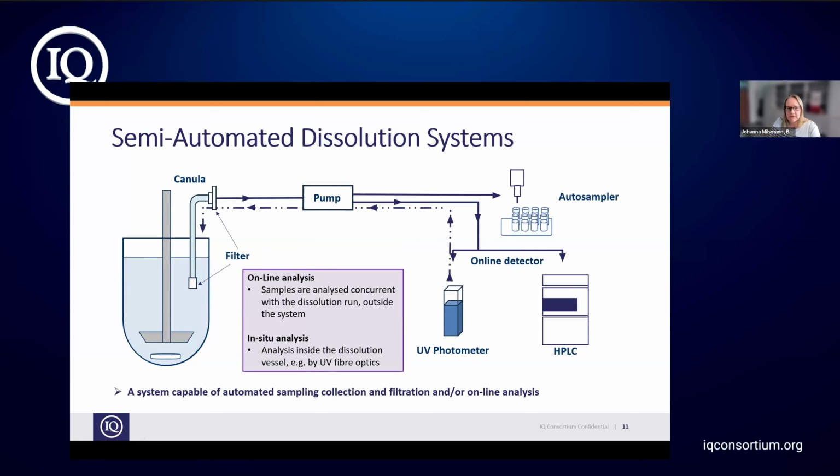So we can either have a cannula filter, which is added to the bottom, which is also introduced into the vessel, or you can have other filters right after drawing the sample. Depending on how much automation you use, you can also have a filter station which changes your filter for you, or you just use one filter throughout the entire setup.